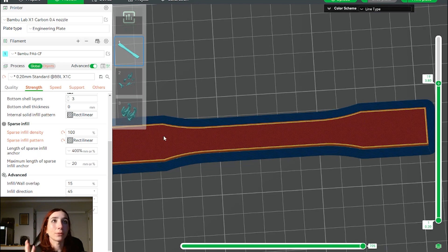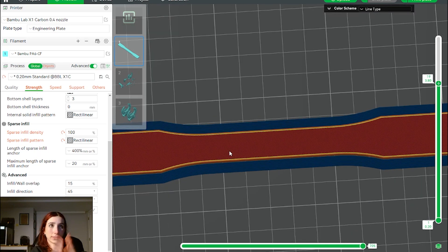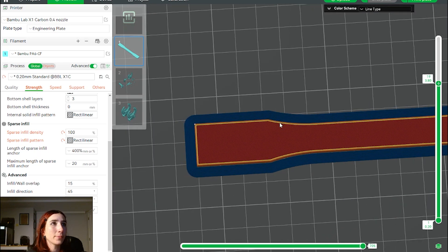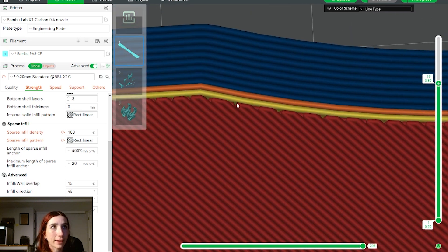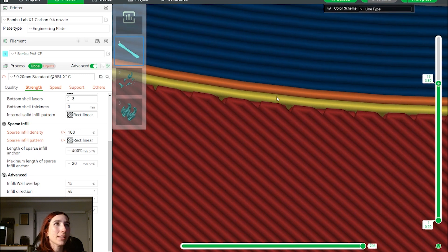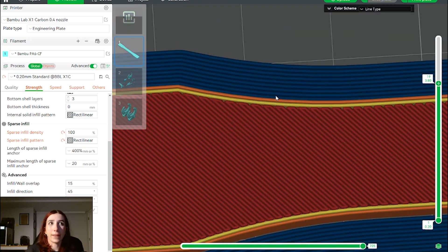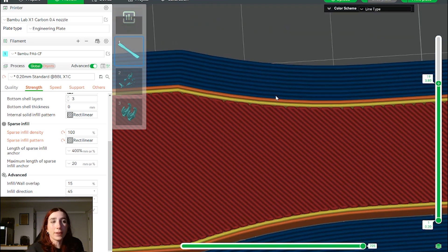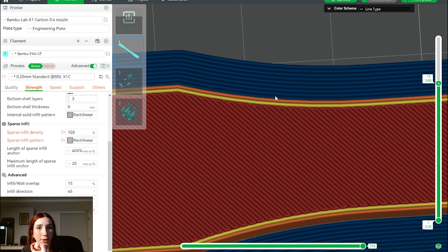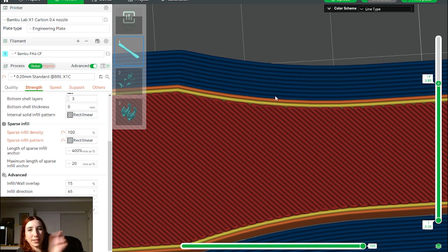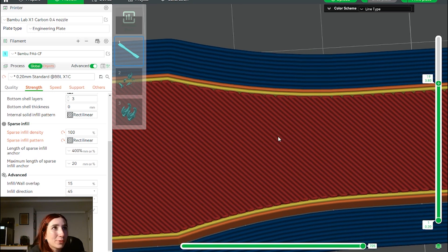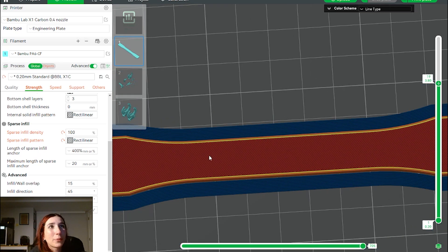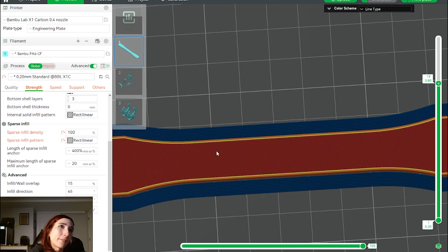If it breaks outside of this region particularly here or anywhere else outside, it is an inconclusive test. Zooming into here we can see that filling in at a 45 degree angle does give us really small voids here. This is as to be expected. You can almost think of layer fill or solid layer fill as like coloring in a coloring book. You start with a shape and you might approach with a crayon or a coloring pencil at an angle to fill in that shape and then you'll have to go back in some areas at a different angle to really get that color even.